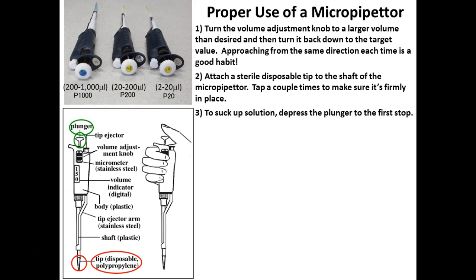These are almost like little tiny test tubes, 96 of them. And I was putting only 4 microliters of my sample into each one of these. So I would actually use a chem wipe, a special paper towel that we use in laboratories, to wipe any excess off the tip before I would put it into my solution that was in my rack.